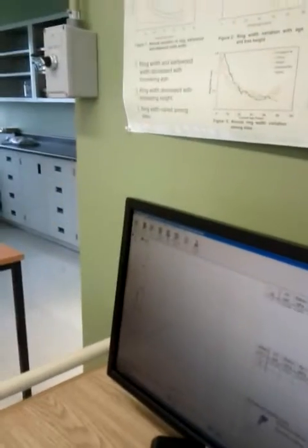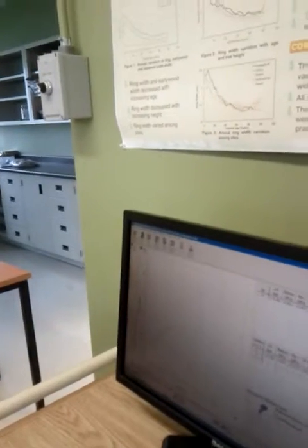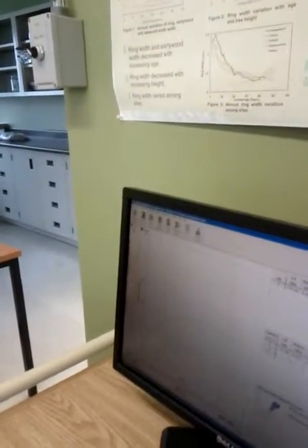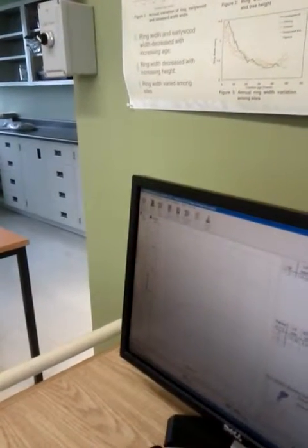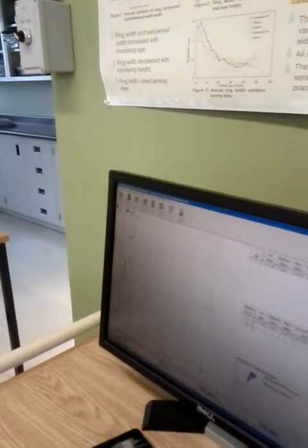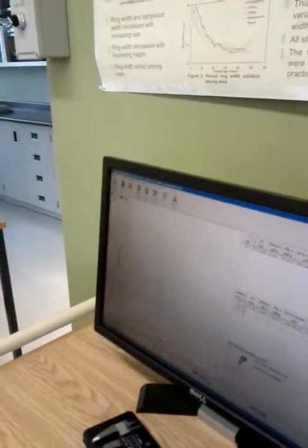It depends on your application needs. I would just not use the word better at all. Can I say if it's more linear, it means we have more wood in it? Sometimes it is. For example, for decking you want a linear part because it's not going to deform.